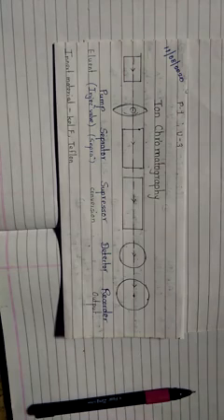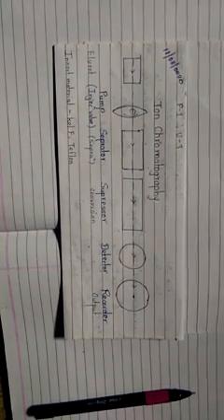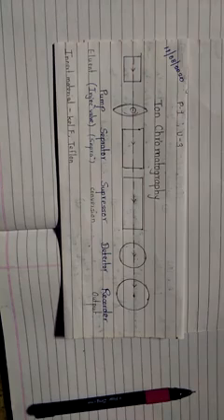As I said before, which eluents are used for cation and anion, for anion separation it gives a good result or signal in the detector.